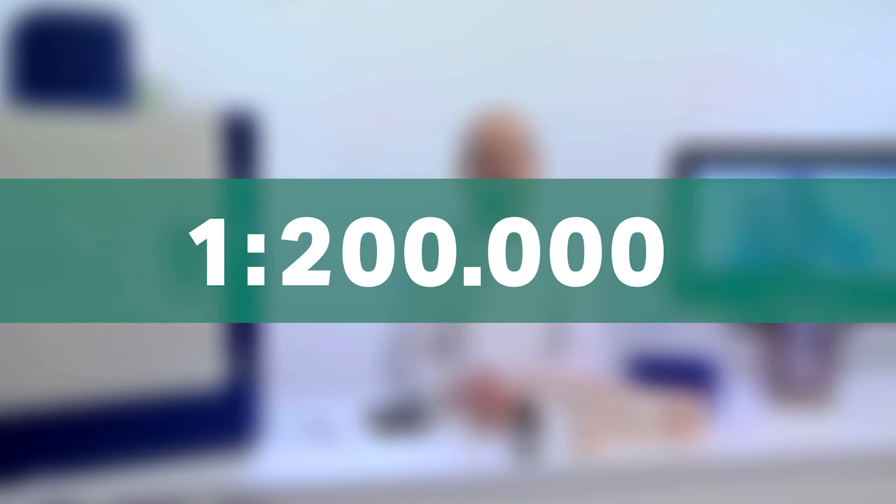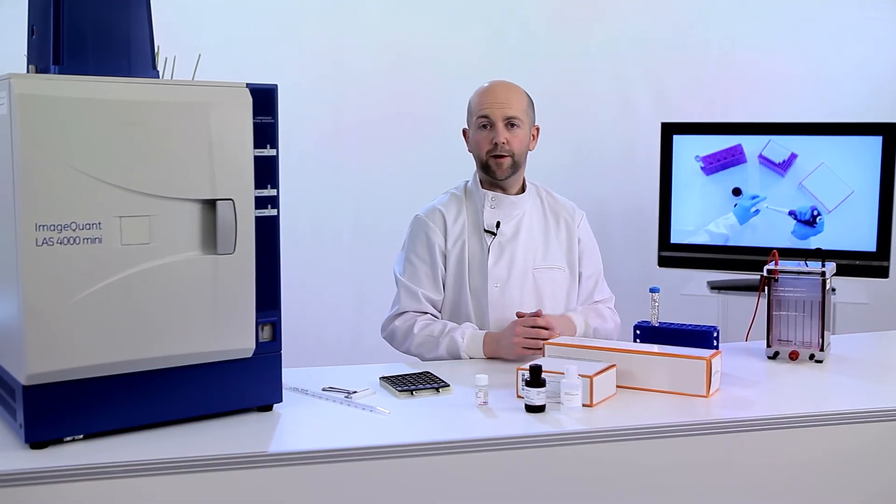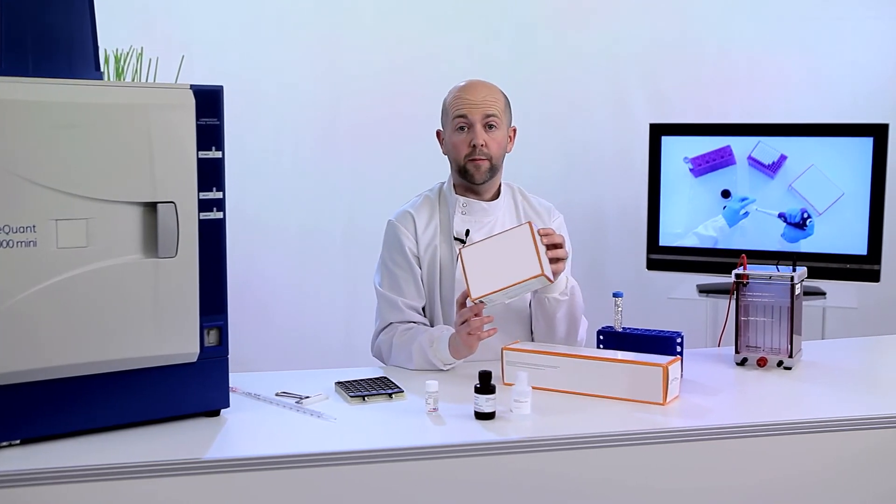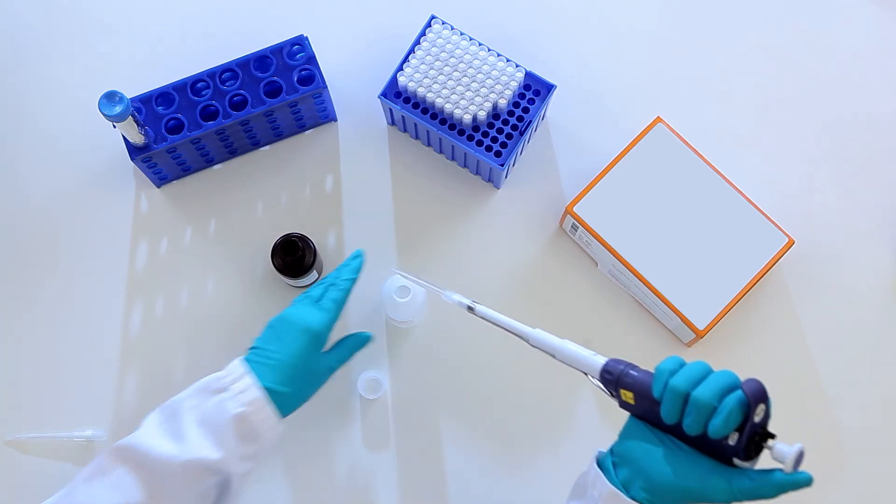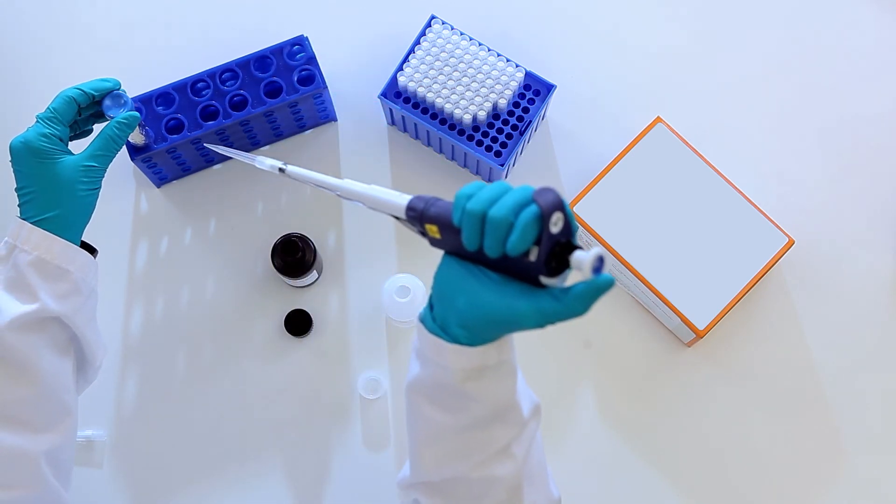Now we can think about detection. Step 3. Now we are ready to use ECL prime. It really is the ideal choice for detection in Western blotting. It works really well with all detection methods.